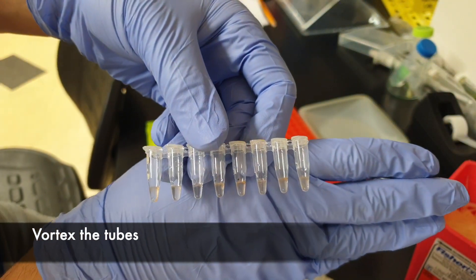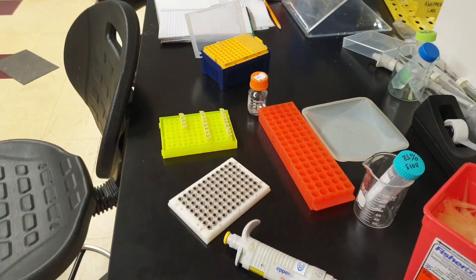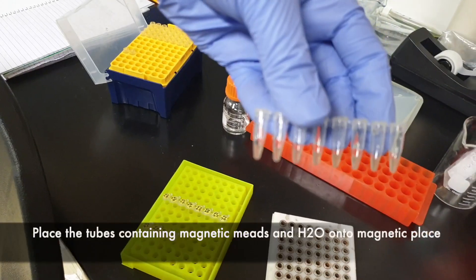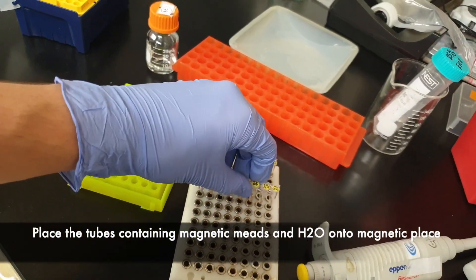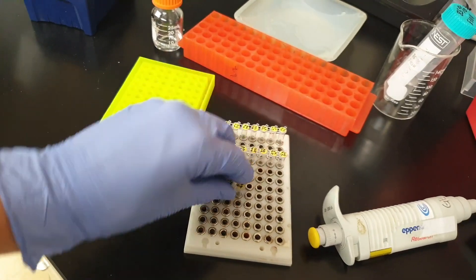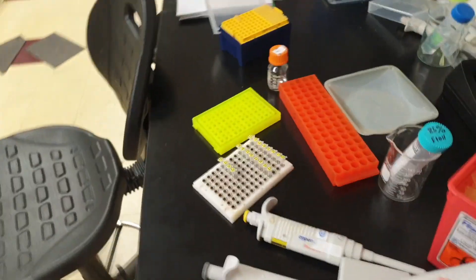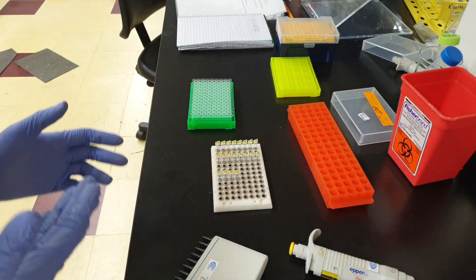Each of these tubes now has about 40 microliters of sterile water and beads inside. Next step, we'll be vortexing them. Then put them on the magnetic plate and give it about five more minutes. After that, we're going to be transferring the purified DNA into the sequencing plates.